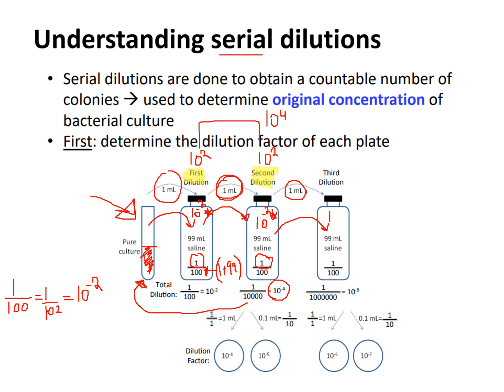So one more time, that's what? Well, that's 10 to the 2. I'm still doing the same dilution factor. But if I'm thinking of my original sample total, right now, how many times did you dilute it? Well, so far you've diluted it 3 times. Let's write right here. So up here, it's 10 to the 2. So that third dilution, it's 10 to the 2.